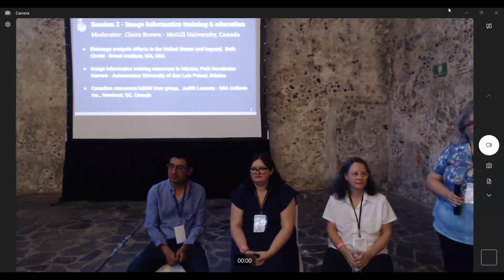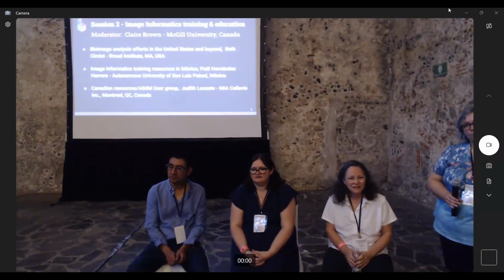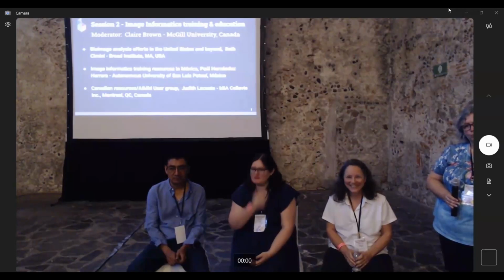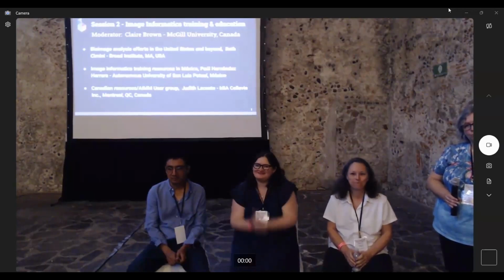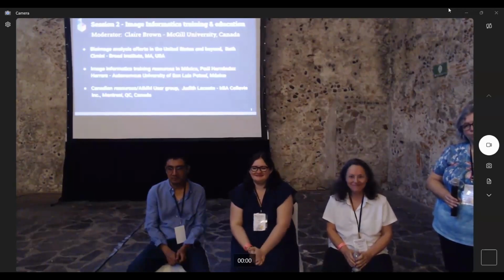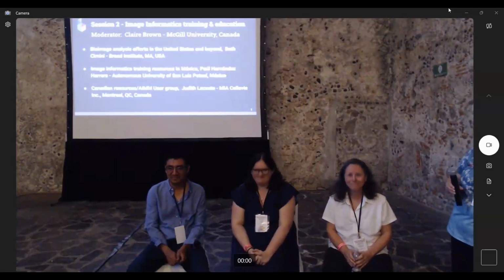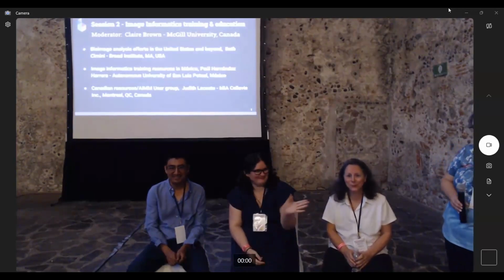So Victoria Rapato comments, I've seen PhD students that reach to their confocal microscope and their sample to get an image, but they have no idea how they're going to analyze the image after they get it, which means they have no idea what properties they want for their image. Has it happened to you that you have to say, the biologists, your images are not proper for analysis, go and get new ones? So I'm seeing a lot of nodding, but I don't know if the panel still wants to comment further.